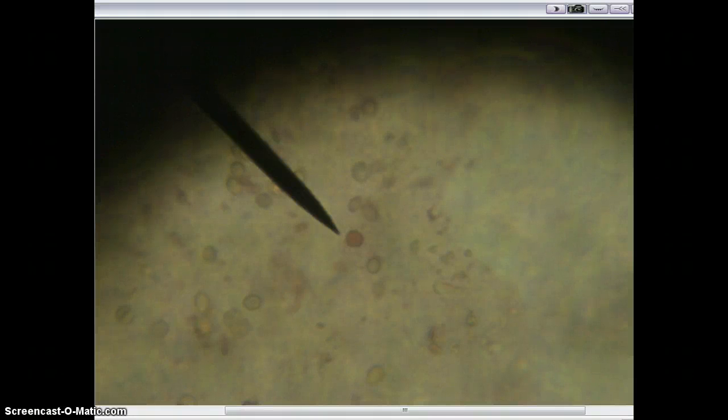Under the microscope, I have some yeast cells, and I put coloring in with the yeast. So the yeast are floating around alive, taking in materials as needed.